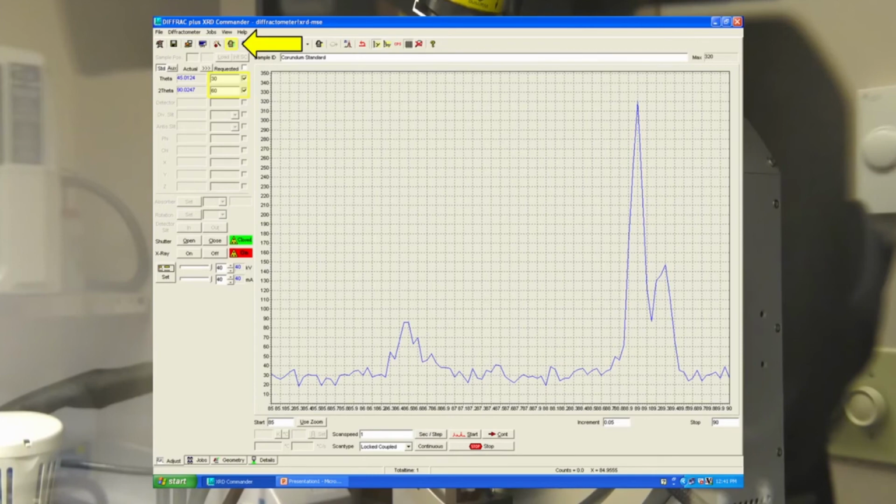locations overlap with K-alpha-2 appearing as a hump on the side of K-alpha-1. Greater separation occurs at higher values of θ. Typically these combined peaks are treated as one. The 2θ position of the diffraction peak is typically measured as the center of the peak at 80% peak height.